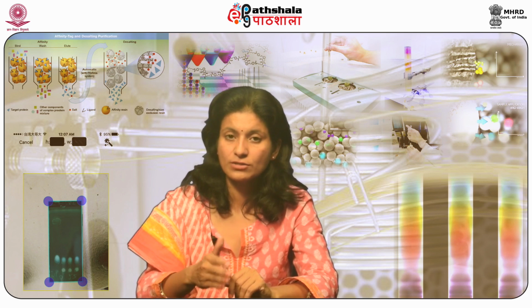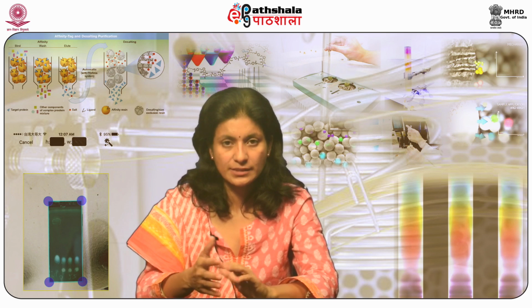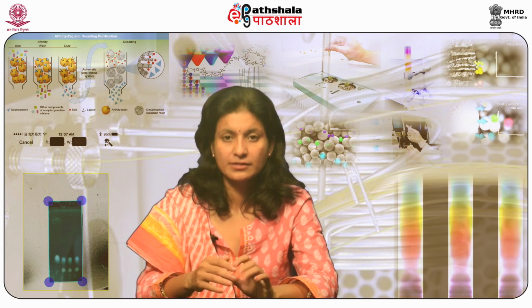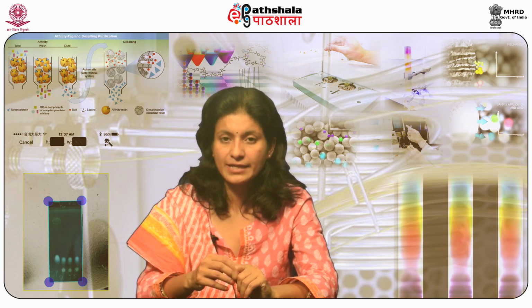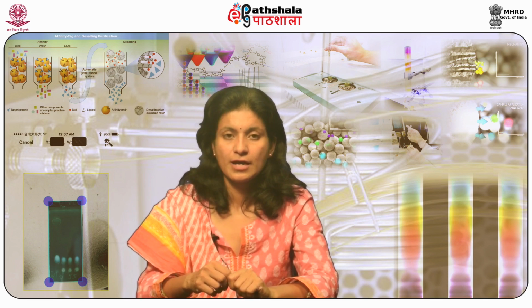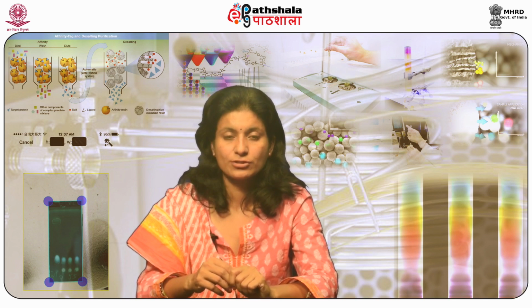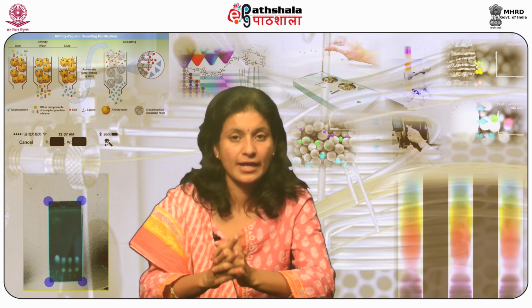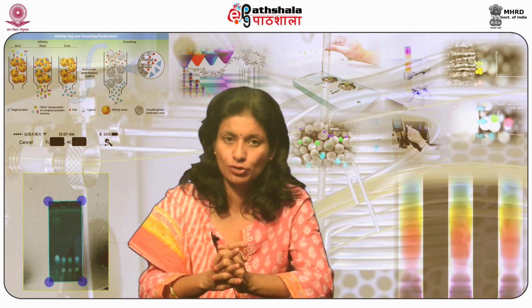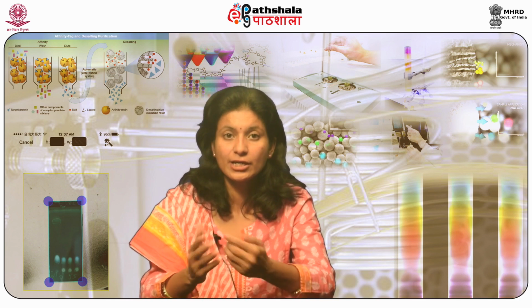It is employed on charged molecules, for example, proteins, amino acids, and nucleotides and related biopolymers of different molecular sizes and nature. Ion chromatography segregation is based on electrostatic interactions between polar and ionic analytes, ionic functional groups fixed to the chromatographic support or gel, and ions existing in the eluent.